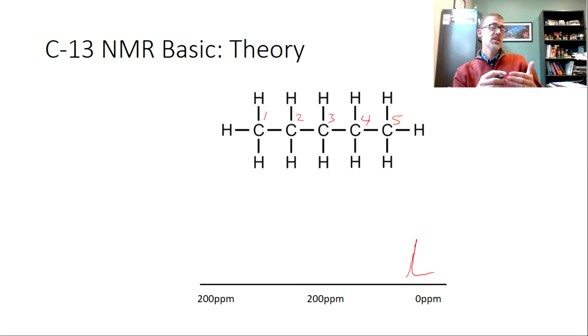go to those shift charts that are available to you in the lab, and you can actually make some maybe predictions as to what characteristics or what functional group, what atoms would cause a carbon to resonate at this energy as opposed to another. But these rather boring, we'll say hydrocarbon terminal carbons, will resonate somewhere around 10.